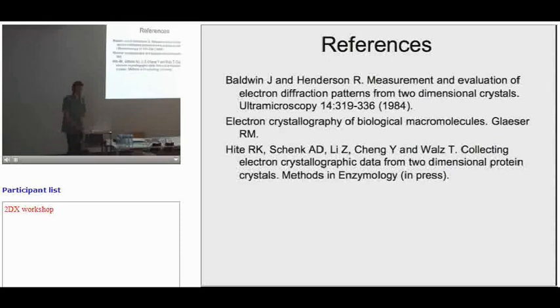You collect amplitudes from diffraction and your phases from images are of lower resolution, so you have to either borrow phases from X-ray crystallography or do a phase extension or something like that. And I'm very interested in knowing how you guys do the phase extension with aquaporin, and also how easy it is to extrapolate that method to other membrane structures.